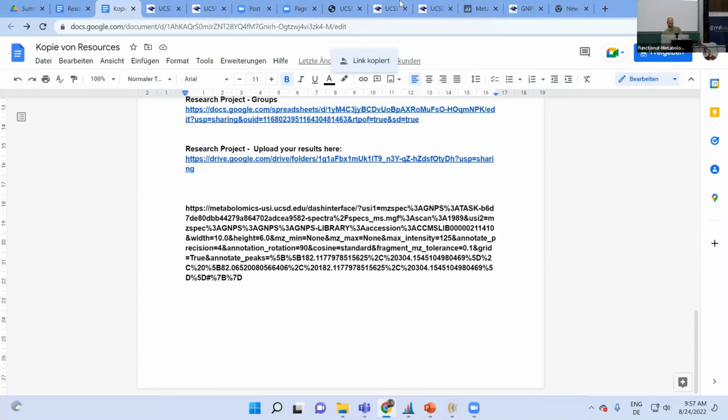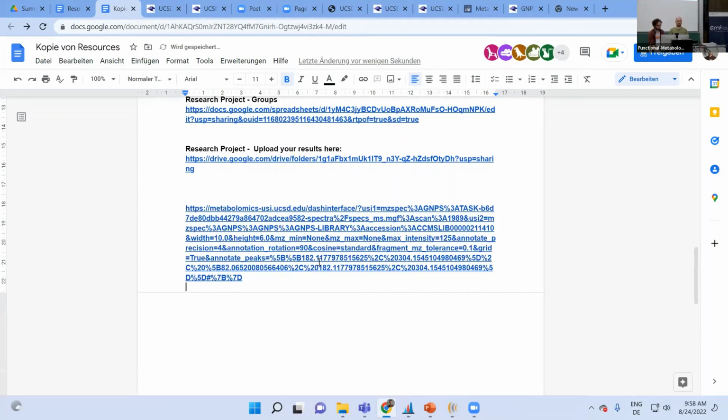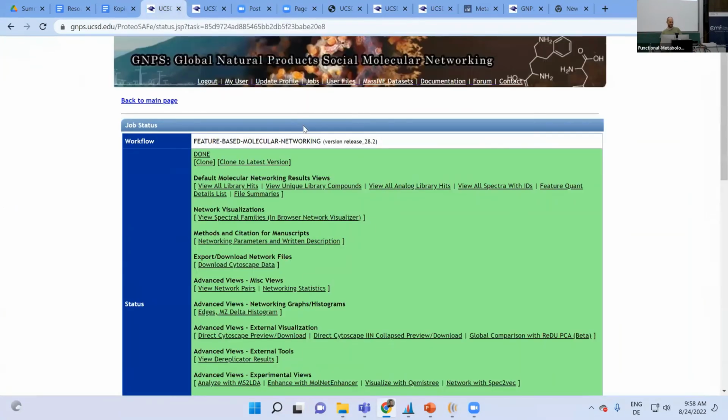All right. So now if you open that link, then you should get to the resource file. And if you copy paste this long URL into your browser, you should be able to not only view it, but also manipulate it. And that I think is a really high level of transparency. Okay. We took a lot of detours now.